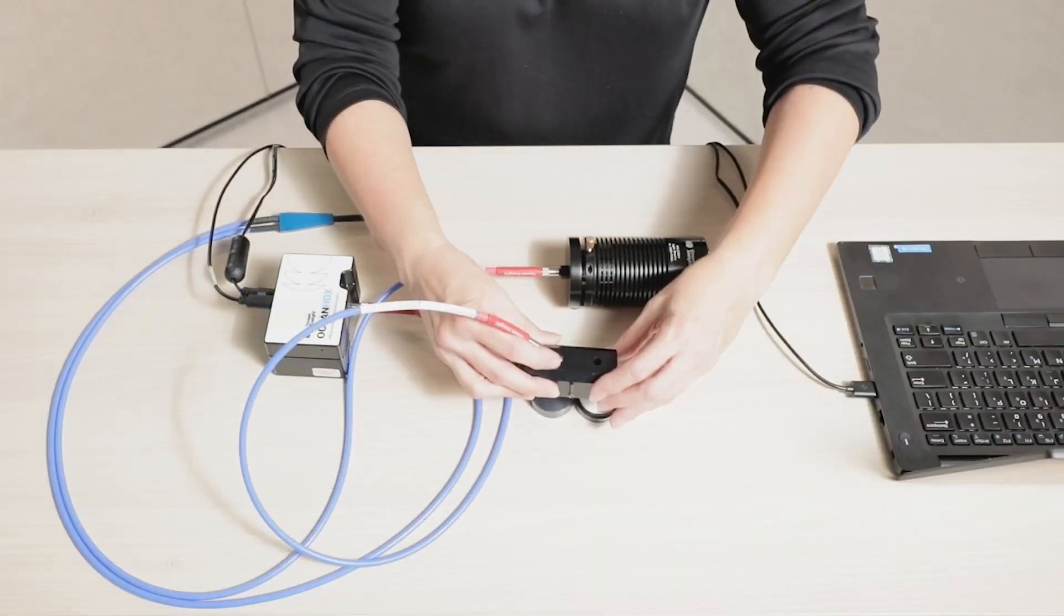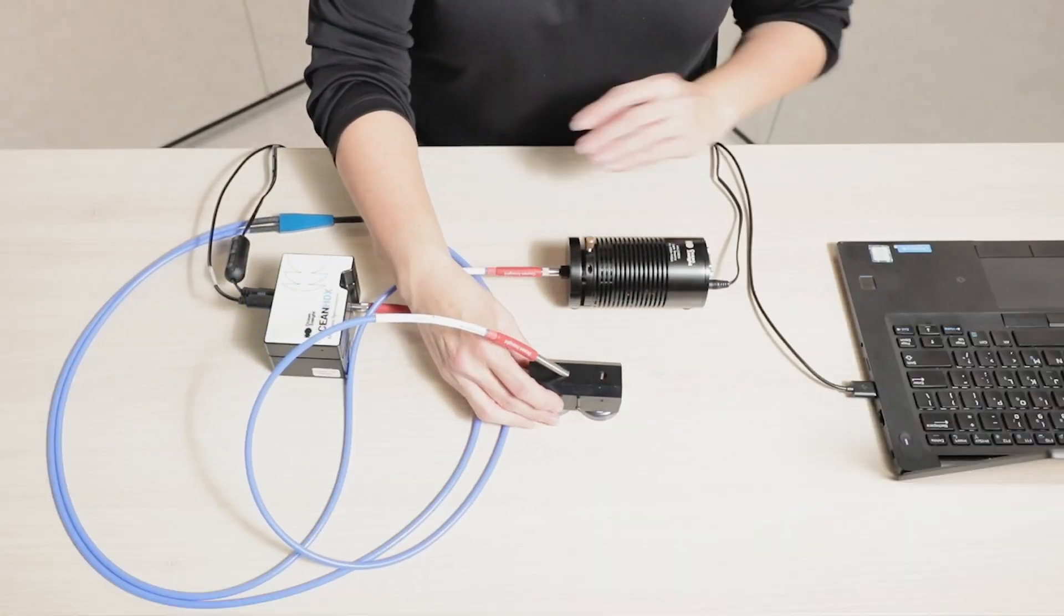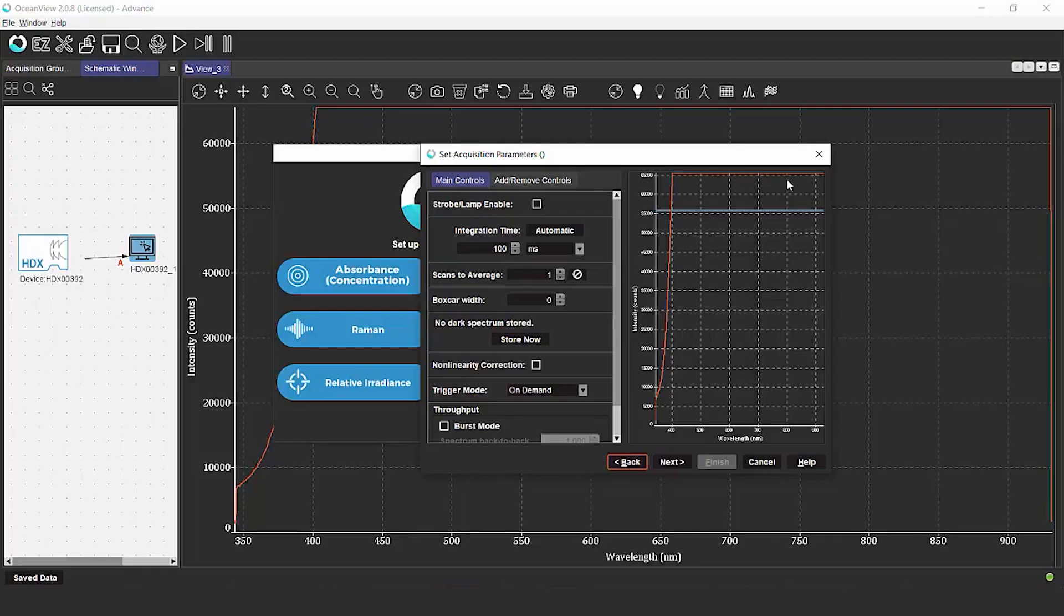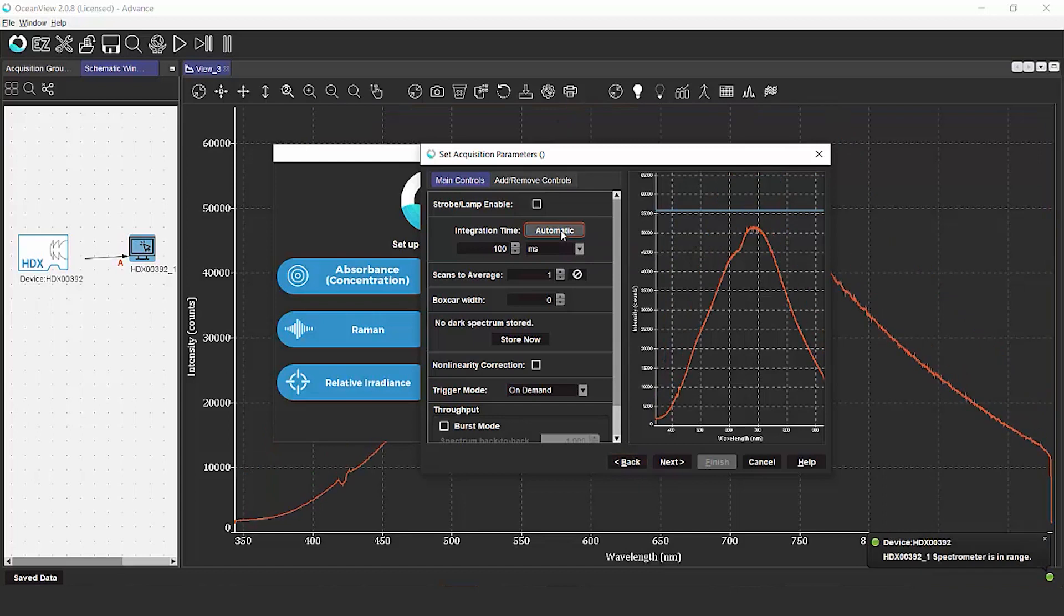So what we're going to do is adjust our integration time to get that spectrum into the ideal range for our measurements. To do that, we're going to place the probe onto our reflection standard. So we're going to click the automatic button to help us get our integration time. It will set it automatically for us just below that blue line. This is going to give you your best performance.